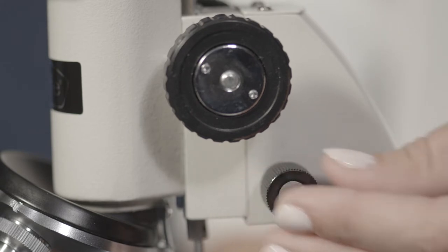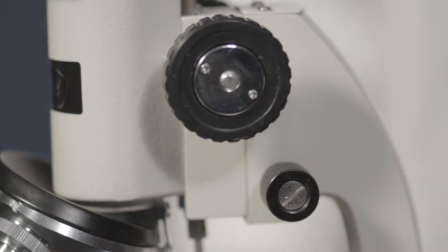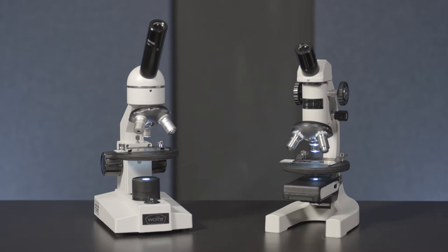This type of focus system is best for middle school studies. Another option that can be beneficial in the classroom or in the field are the Wolf Cordless Microscopes, items 591210 and 591182. This type of microscope is available in both three-quarter and full-size microscope designs.